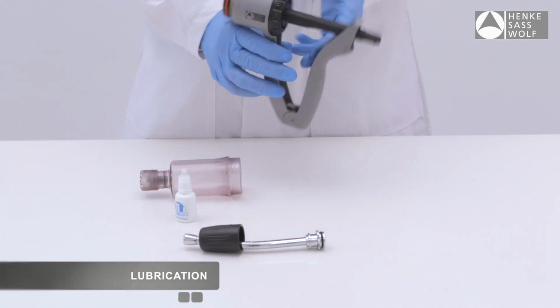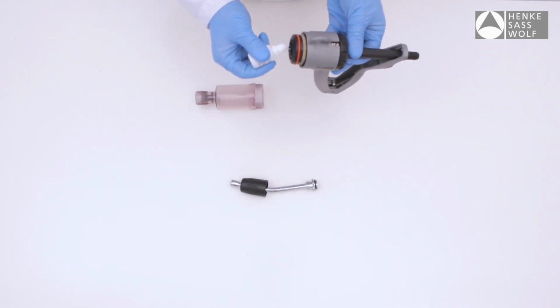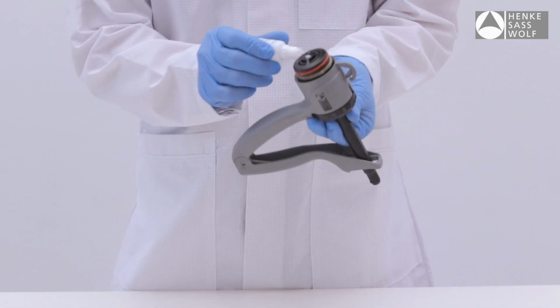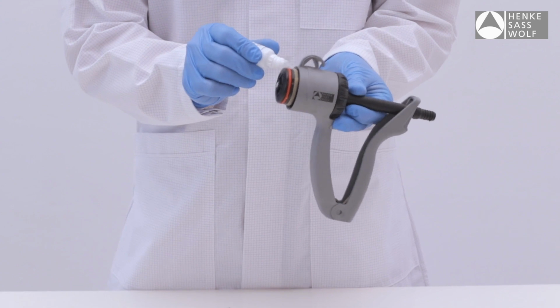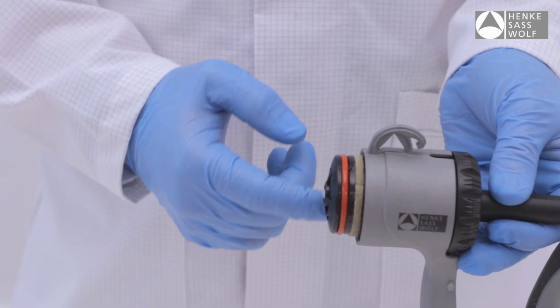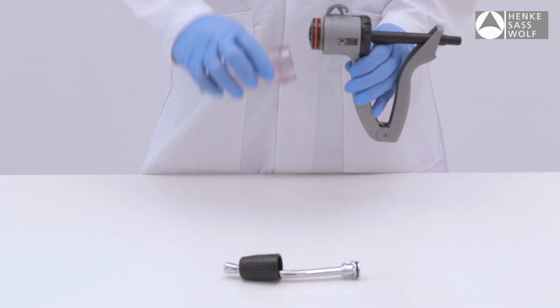Lubricate the O-ring and felt ring with 100% pure olive oil, cold squeezed, or equivalent vegetable oil. Please follow the manufacturer's durability and storage life instruction. Do not use mineral oil, silicone, WD-40, glycerin, or alcohol. Petroleum-based products harden the O-rings, reducing the life of the component. Reassemble the drencher.